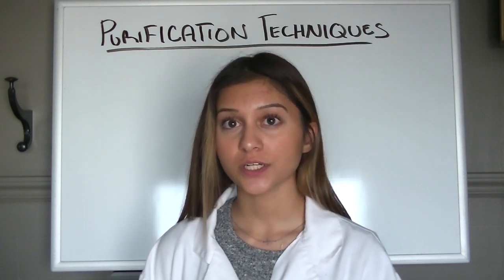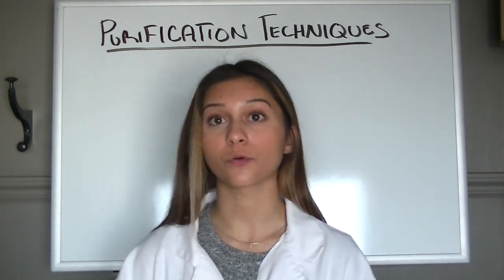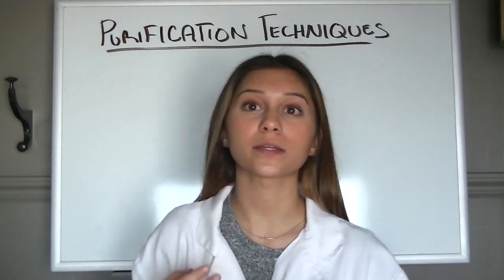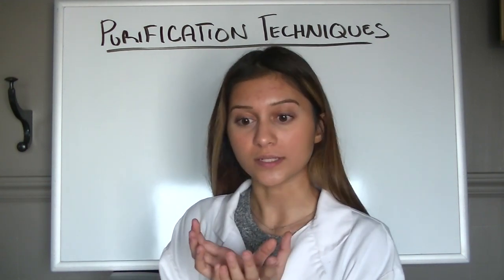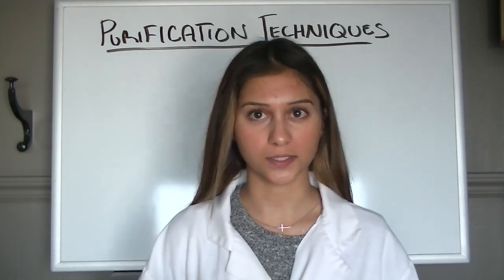Next, we will discuss drying agents. A drying agent is an inorganic salt that readily takes up water in order to be hydrated. When placed in an organic compound, drying agents find extensive application in purifying the chemical substance by the removal of water or any other impurities we do not want in it.